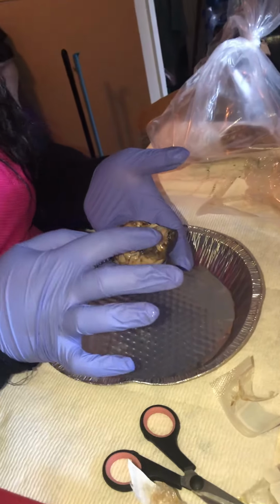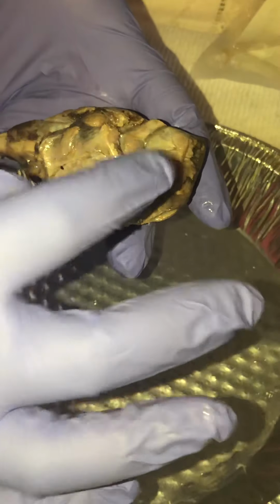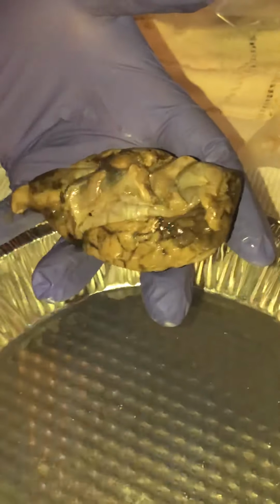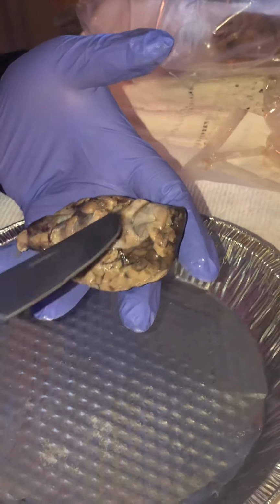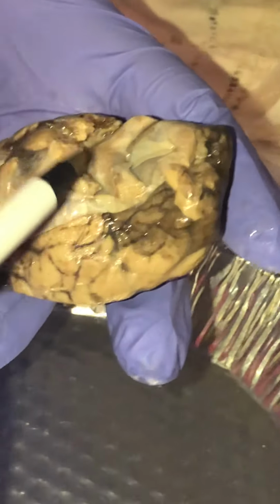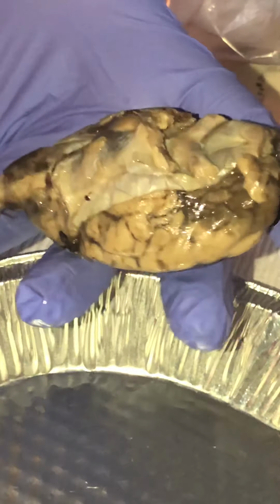Right here we have these cranial nerves. There are 12 cranial nerves, and they send sensory and motor signals between the brain and the spinal cord. These are the cranial nerves right here. Then we have the optic nerves, which are right here, as you can see. The optic nerves transfer your visual info from your retina.